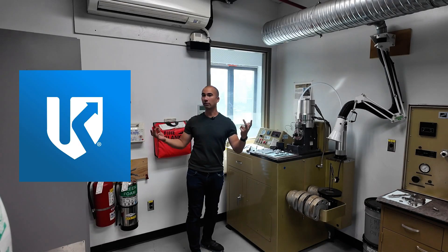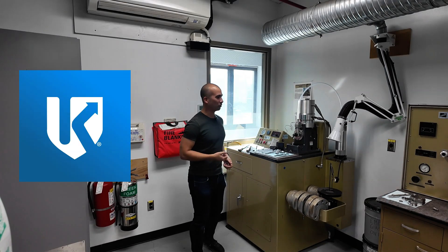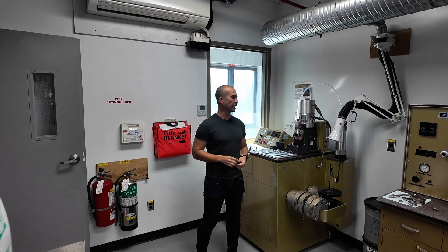I'm just here in one of the King Labs, and they've been kind enough to lend all this equipment to me for a little bit, just to show some of the bench tests that would be done.